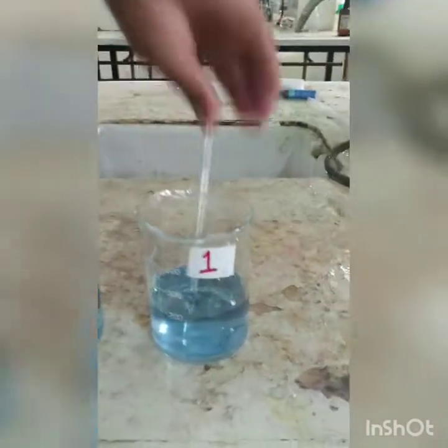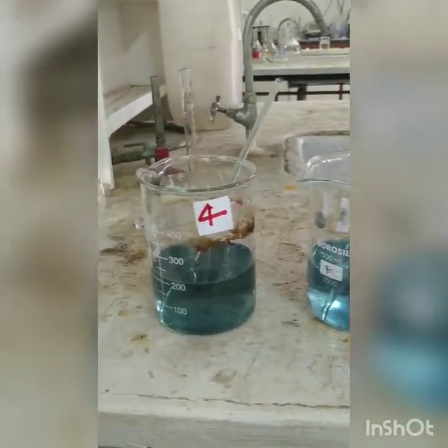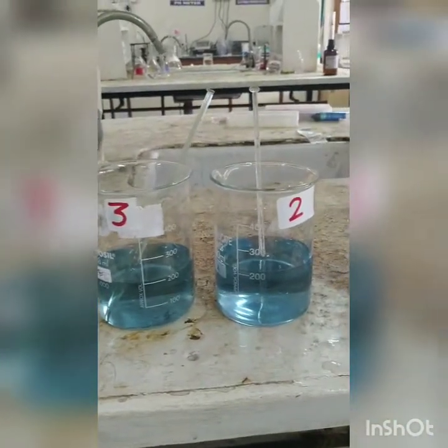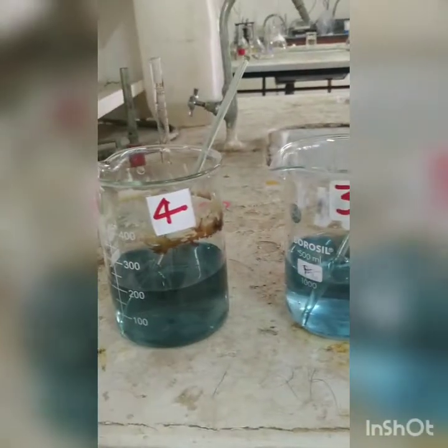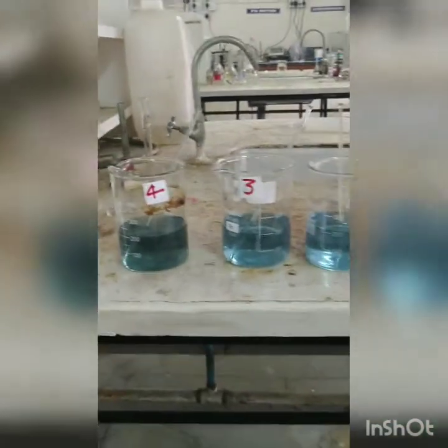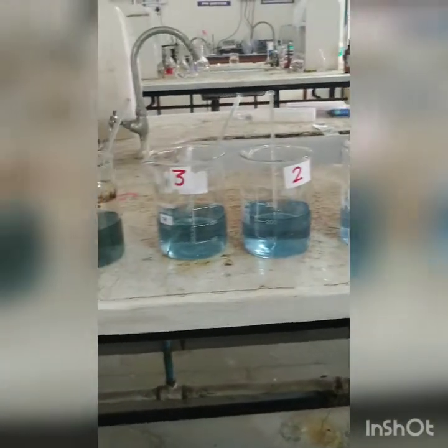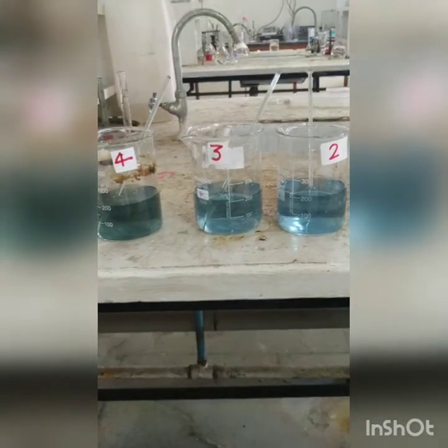So if you see it distinctly, beaker 1, 2, 3 and 4, the intensity is gradually increasing. 2 and 3, although not much difference, but still you can see that 3 is darker than 2, and 4 is darker as compared to 3. So it is an indication that the chlorine that has been added, or the dosages, are different. Now these dosages we will further titrate and then we will find the residual chlorine. So let us start with the titration now.